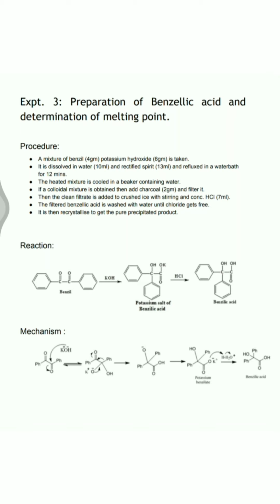Now concentrate on the calculation part. In this part I have not shown the calculation because in the last part I showed it in very full detail. We have to calculate the molecular weight of benzil and benzilic acid from the periodic table.